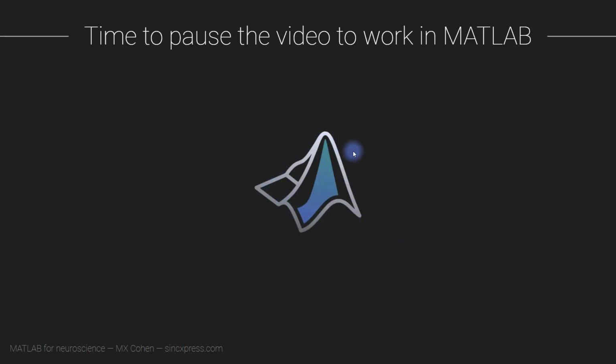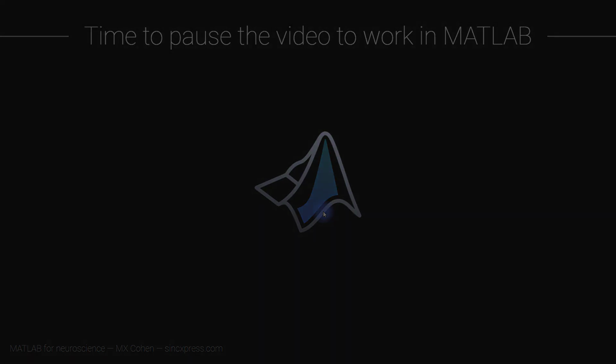As with previous videos, this is now your chance to pause the video, switch to MATLAB, and work through the partially completed MATLAB file. And now I'm going to switch to MATLAB and walk you through my solution.